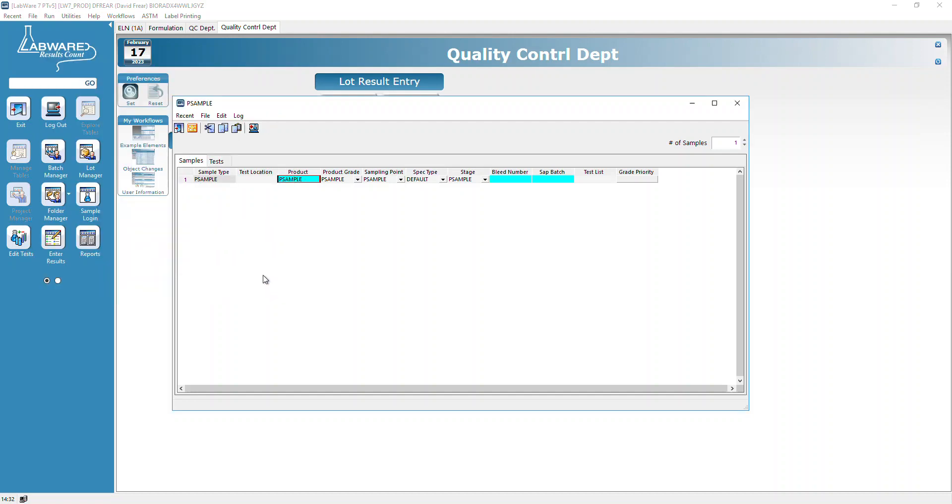You can see we've got P sample and P sample SR as choices. SR is for San Ramon, so we're not going to do that right now. Everything else populates across.